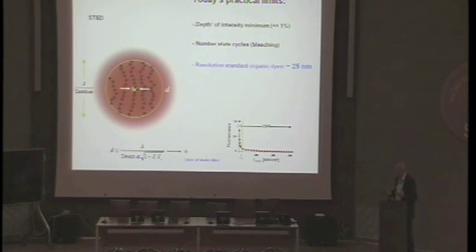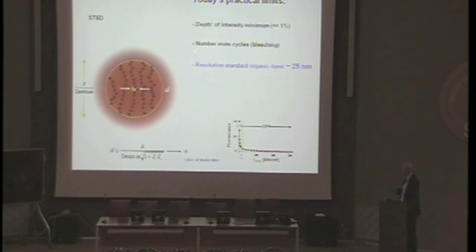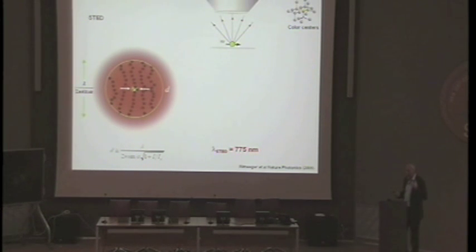And this is quite a lot. This is a factor of 10 beyond the diffraction barrier. This is just an indication that you can go very far if this problem here is sorted out. So if you can turn it on and off many times, you can demonstrate it. It's like a pilot experiment to show you what is coming.